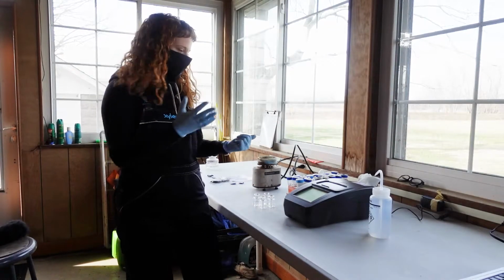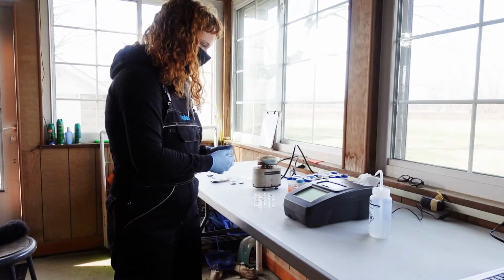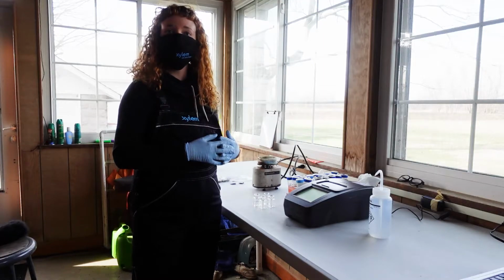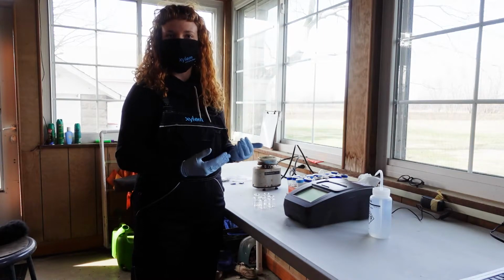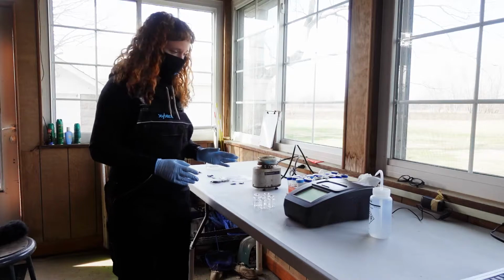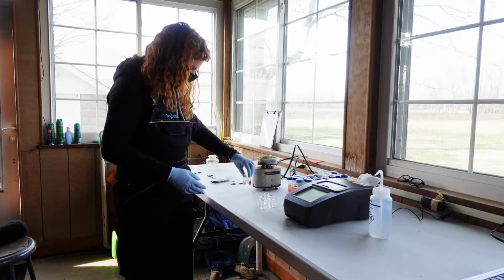All right, so while my samples are reacting, the first thing I'm going to do is come to my instrument. If this is the first time of the day that I'm coming to the instrument, I need to perform a zero. That's like a calibration for the instrument. It tells the instrument what a zero concentration of nitrate looks like. So what you will find when you come in next to your instrument, you will find these glass cuvettes.